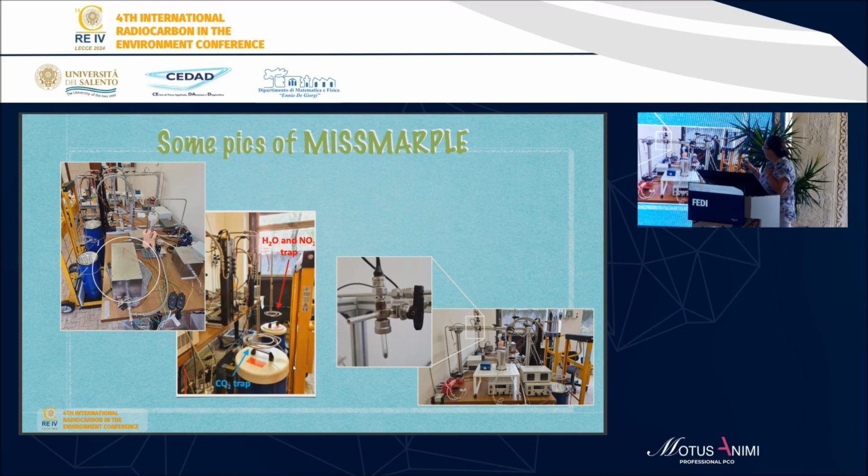So the idea is to perform the reaction forming graphite directly on iron already pressed in such a small copper insert.